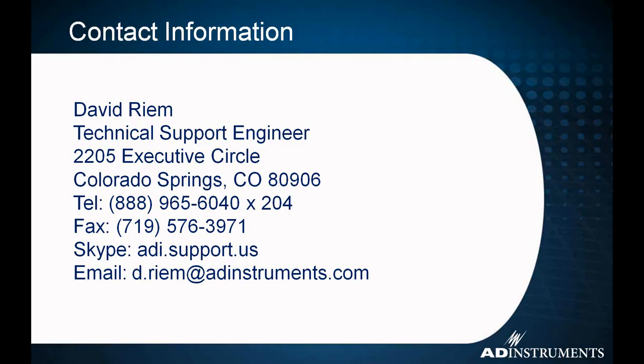I have a question from Brian. Is there a way we can set up our own workflow in other modules or in the program in general? Unfortunately, no. Actually, PVLoop is our first foray in doing that to kind of see how it works with a module. And if it's well received by our customers, I'm sure we'll definitely look at it for other modules. However, PVLoop is so intricate. There's so many things you need to do. It really lends itself to workflow. But for instance, like say blood pressure, maybe not necessarily, but it's something we're open to and we'll probably explore in the future if the workflow is well received. So that's pretty much the answer to that question.